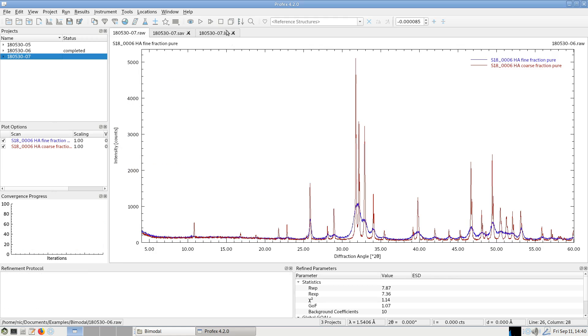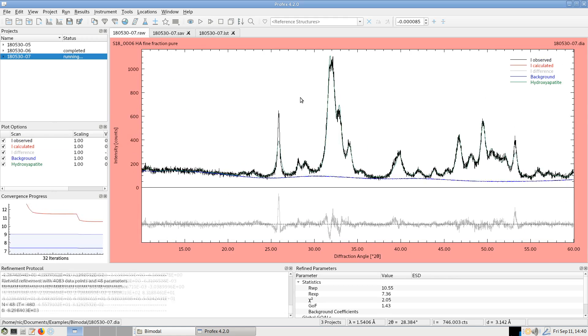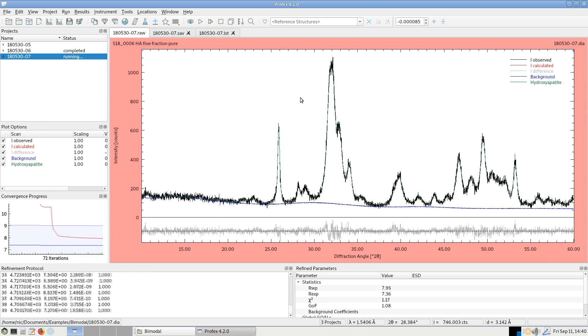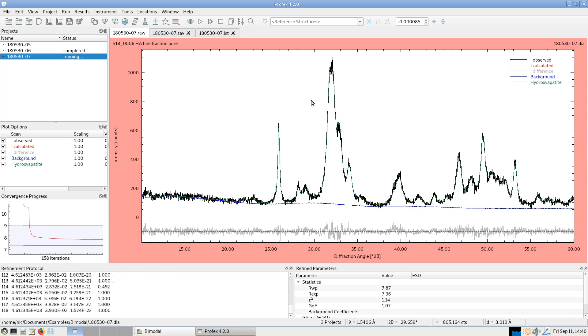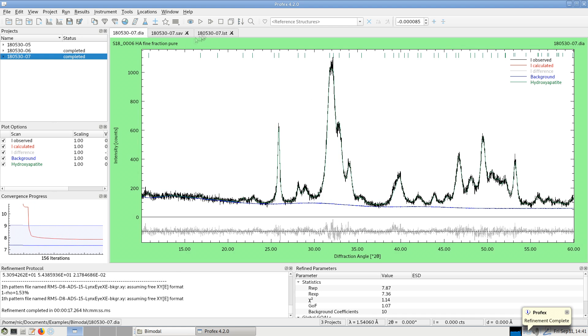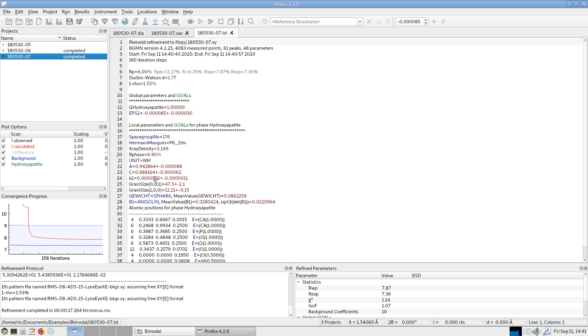And in comparison, if we refine the nanocrystalline one, we get a mean crystallite size along the C axis of 47.5 nanometers and along the A axis of 12.21 nanometers.